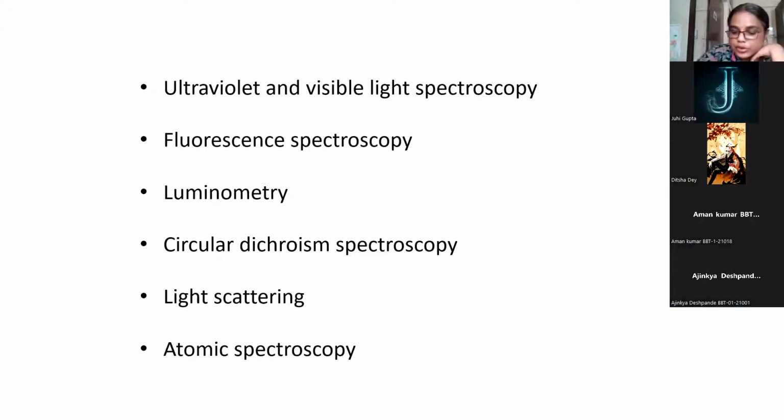Okay. So when we talk about interaction of light with the matter, what happens when light falls on a particular matter? What do you think? What happens when, say, light falls on you or light falls on a cupboard? What will happen to the light? What is the property of the light in this case? It reflects back.